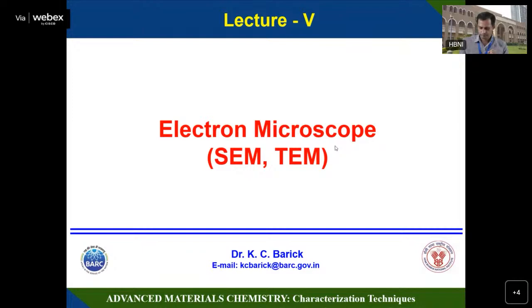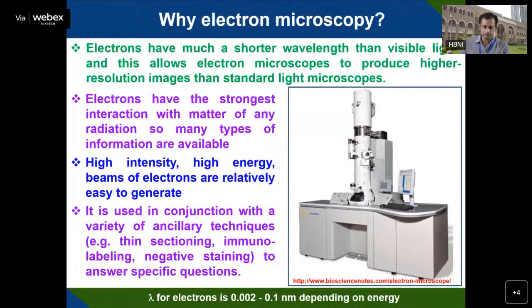Good afternoon. So today we'll discuss electron microscopes, mainly the scanning electron microscope and the transmission electron microscope. In the last class, I told a little bit of the basics about the electron microscope, and I have already discussed why we require it.